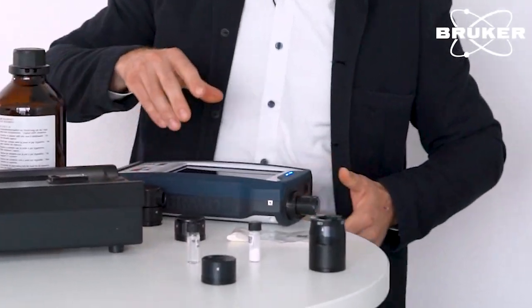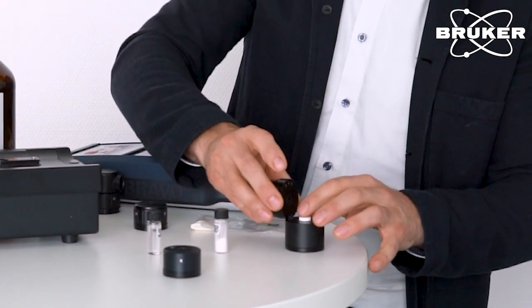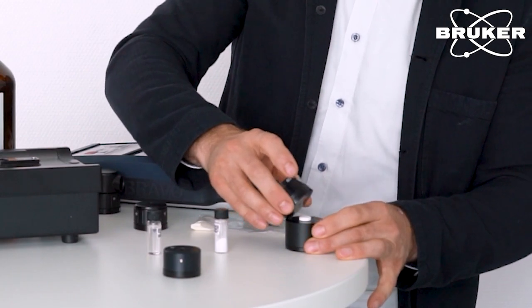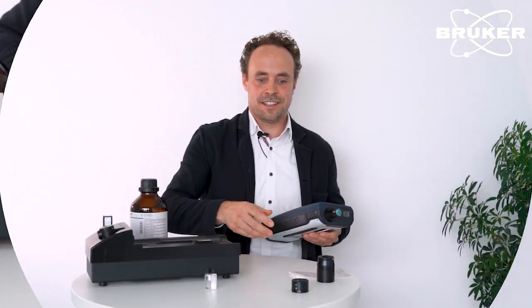Measurements in tablets are as well supported. Therefore, we have this measurement adapter here where we can place a tablet on a spring-loaded barrel, just close it and attach it to our handheld spectrometer.